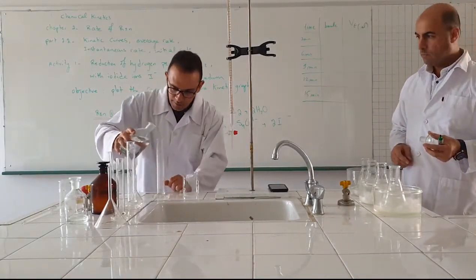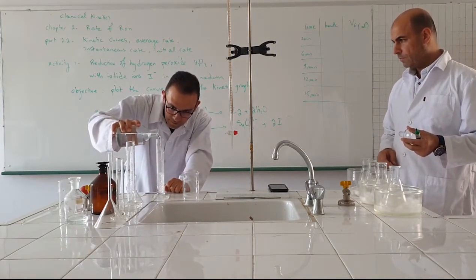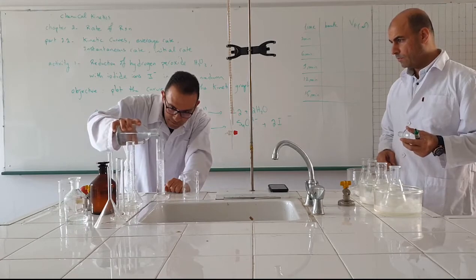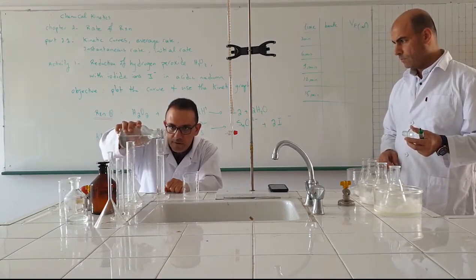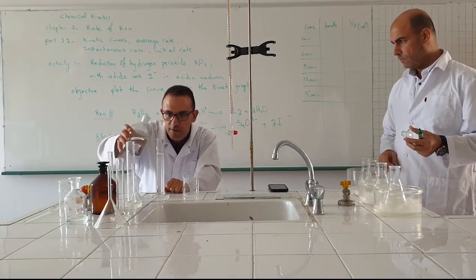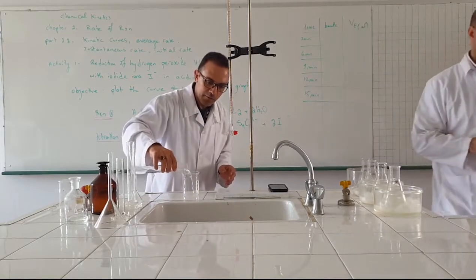This is potassium iodide. Okay. Transfer this volume into the beaker.